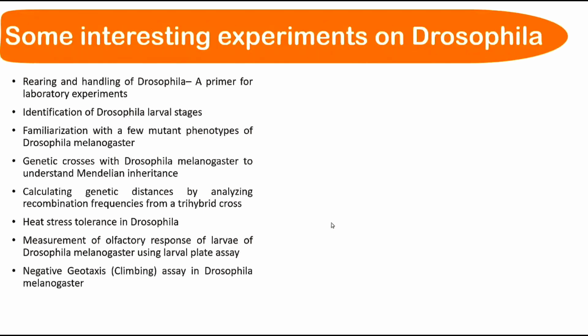Then there is another study which we call the negative geotaxis climbing assay. Like I said, Drosophila prefer to move upward, right? If you put them in a vial, they will always be going upward. So if you bang them on the floor, they will start climbing up. But if you keep banging them, probably after some time they will lose their ability to climb up.